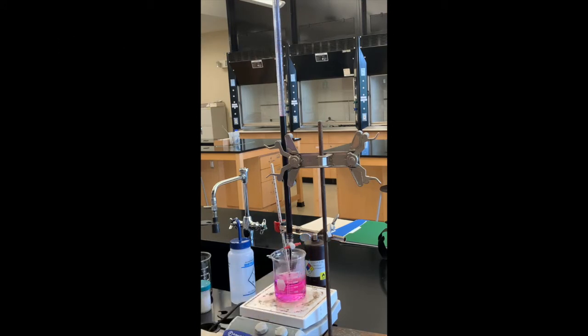I probably should have added that a little slower, but here we are at a pink color that is persisting in our solution. I'm going to go ahead and read the final volume — we've reached the end point of this titration.